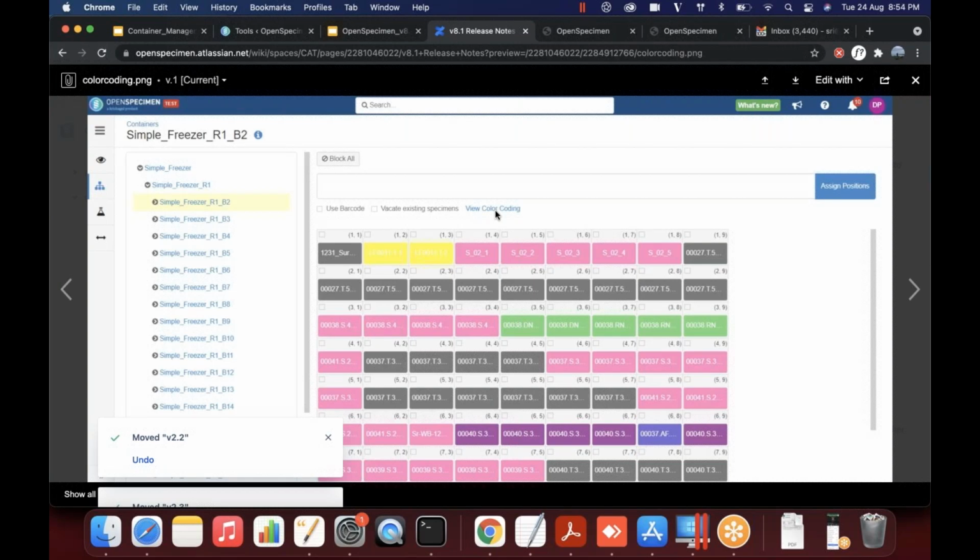You can go to the drop down manager, and there is an option where you can say which specimen type should have which color. For example, if there is a favorite color of yours that you want to assign to a DNA, or if there is an industry norm, you can do that. You can set it up across the system configuration. The end users can click on this to see a kind of legend of which color is which specimen type.